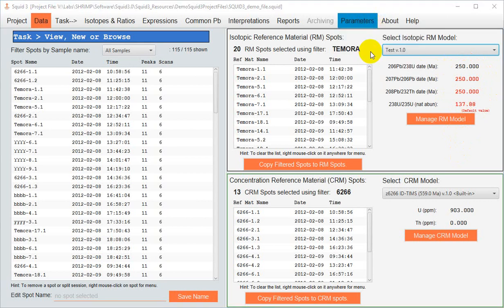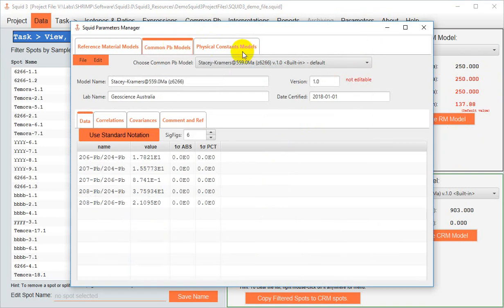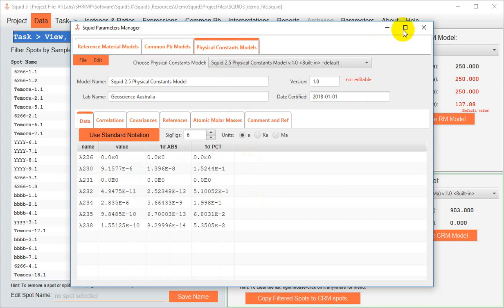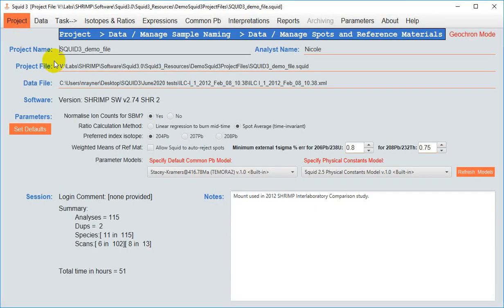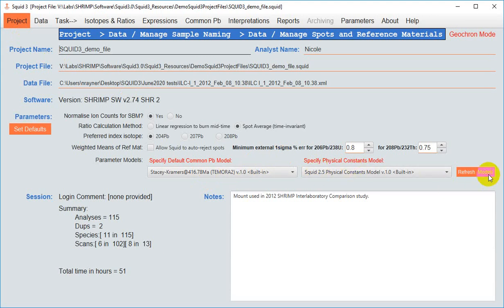The mechanism to make or edit models is the same, regardless of if it's a reference material, common lead, or physical constant model. In the case of these latter two, common lead and physical constants, you will want to go back to Project, Manage Project, to select these new models if you wish to use them, or if you had edited an existing model, you want to refresh models with this button here in order to enact your changes.